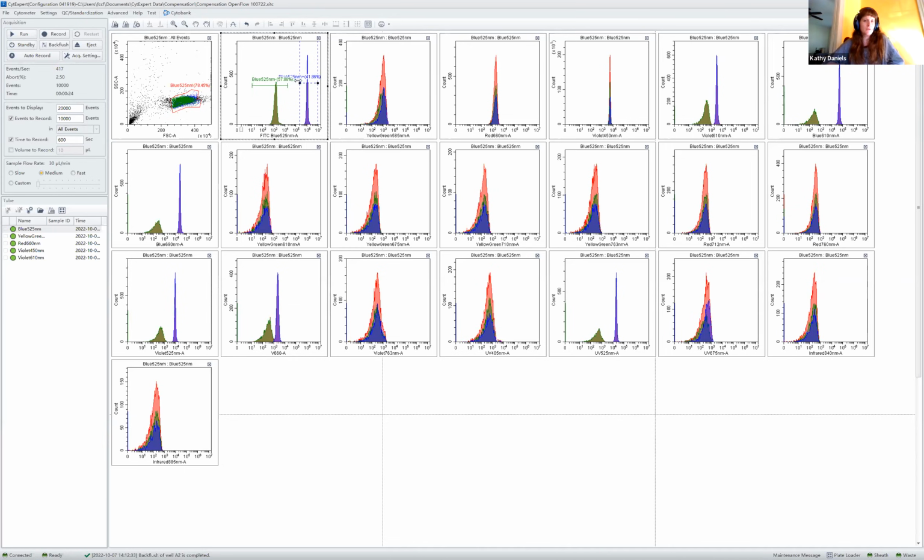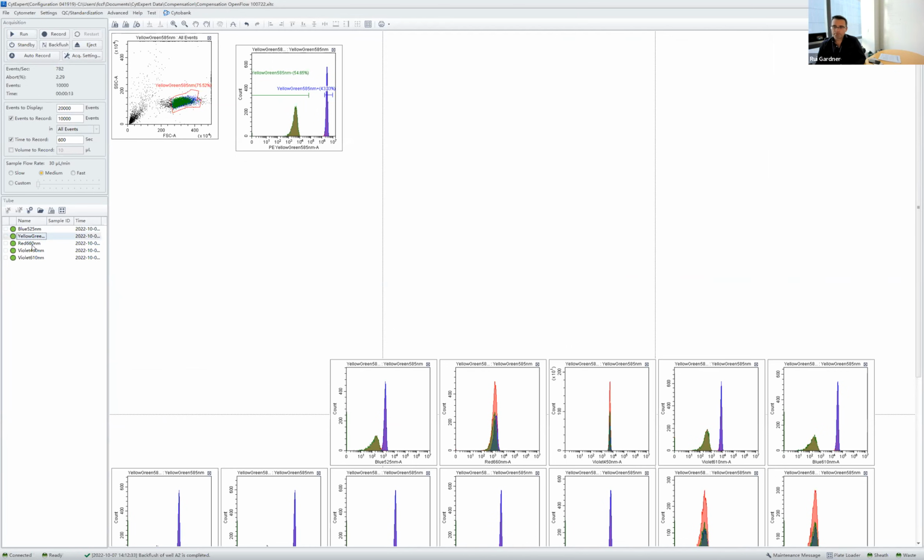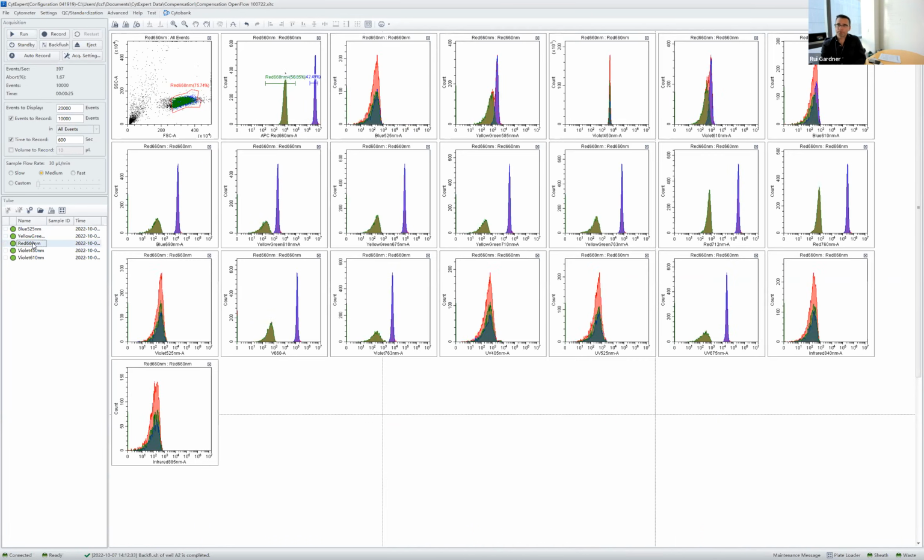I think with any instrument, if you just keep injecting air and the lasers are being directed at a flow cell that air is going through, it's not going to be great for that flow cell. But as far as getting rid of air, usually it doesn't have that much of an issue. You carry out a prime function and it's usually pretty clean. If you've been running air for a little bit longer, I'd suggest running a couple of primes and checking the signal stability by time. Have a dot plot open with time on the x-axis and the fluorescent detectors on the y, and make sure your signal is nice and clean. That would be my suggestion, just to test that. Okay, thank you.